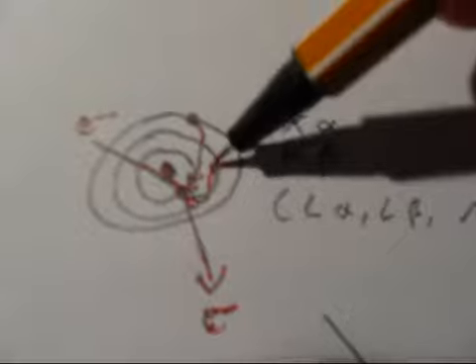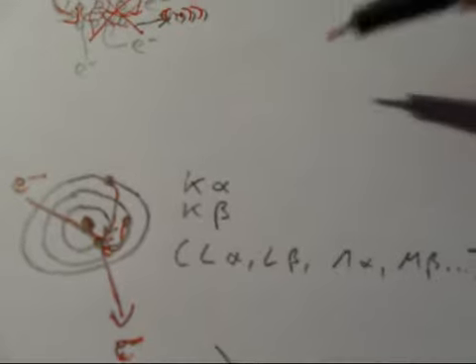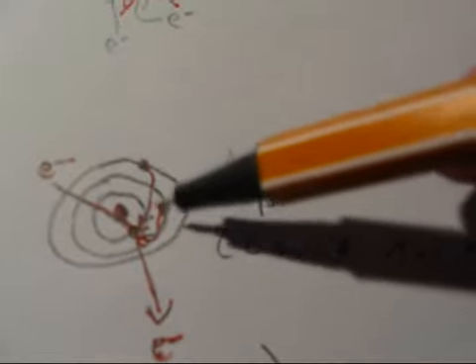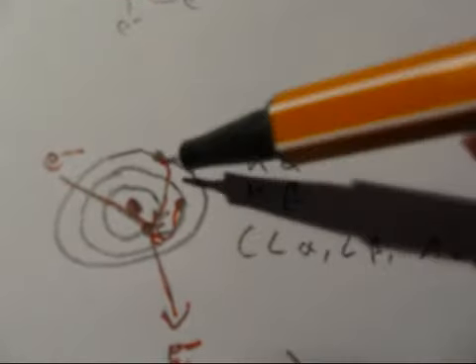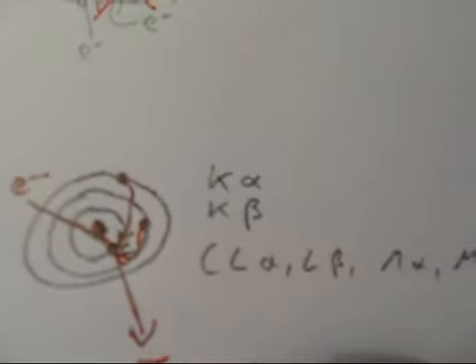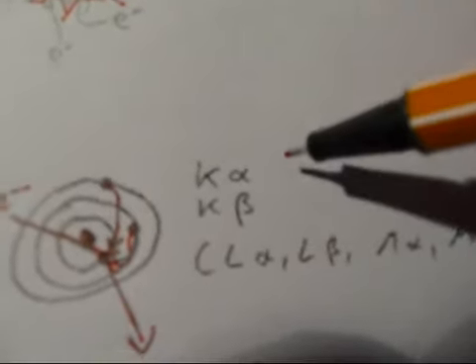There may be an L electron getting knocked out and has to be filled up, so that may be L alpha, L beta radiation, stuff like that. But what is also important to note is that you have actually different subshells within these shells. So the electrons will jump in there to fill the gap, and by doing that, that will produce characteristic X-rays.